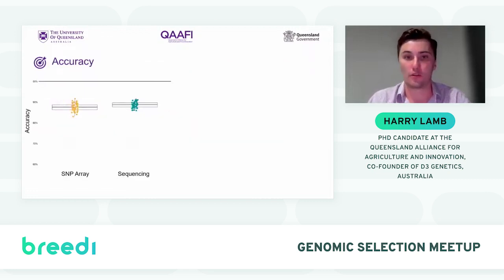Here are the results for our accuracies. You can see on the left there, we have our SNP array accuracies, and these are the accuracies of genotyping 700,000 different positions across the animal's genome. And you can see in Australia, our SNP arrays for commercial producers are roughly 88% accurate. And the sequencing data we got on farm, we got a genotype accuracy of around about 89, 90%. So we actually got better accuracies than we did for the SNP array. Next slide, please.